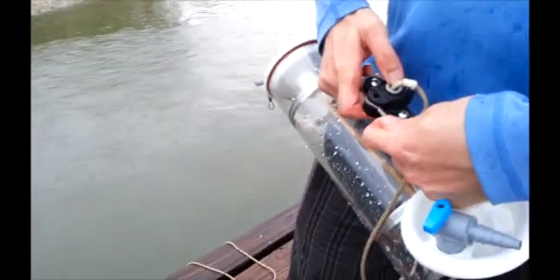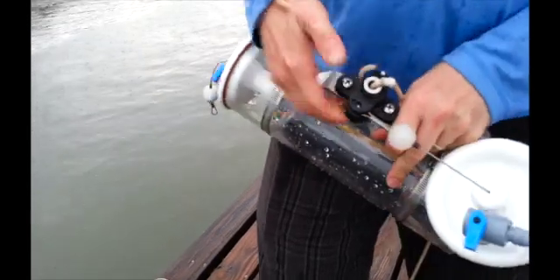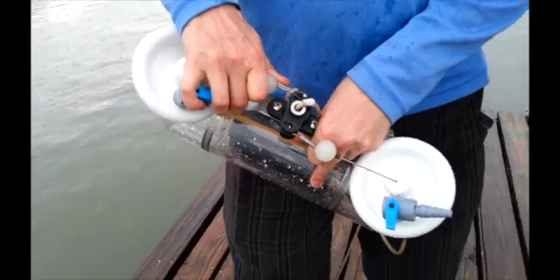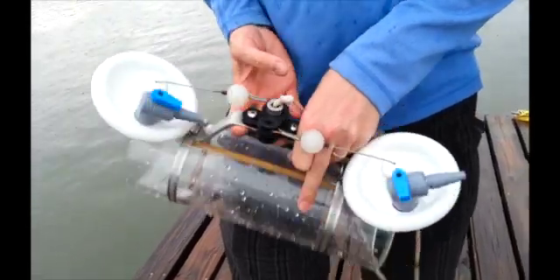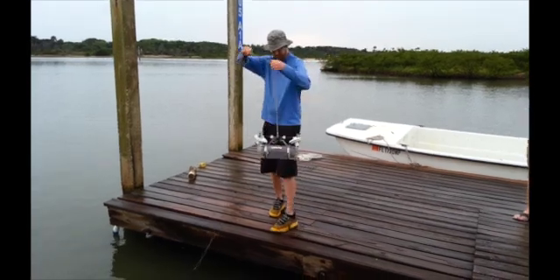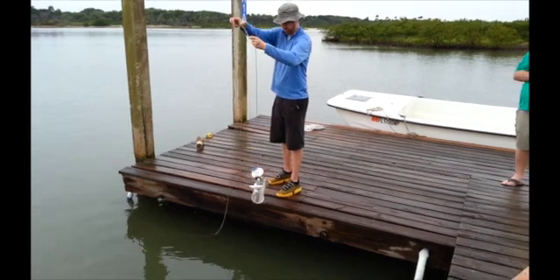Here is a demonstration of the Van Dorn trip mechanism. The end cap assembly loops are hooked to the trip mechanism pens, and pressing the button releases the end caps to seal the bottle. Once the trip mechanism is ready, the sampler can be rinsed.